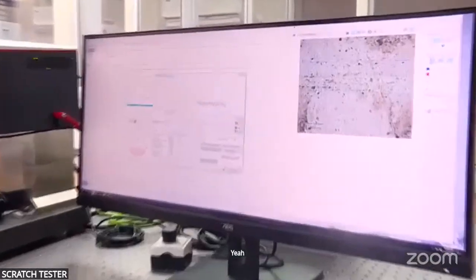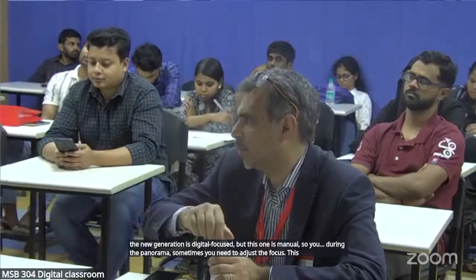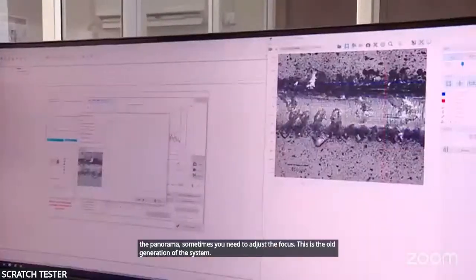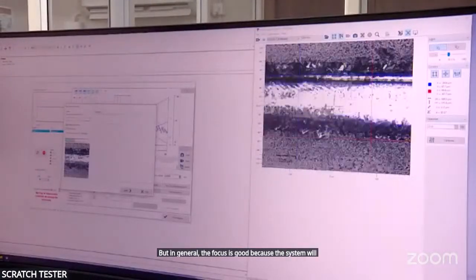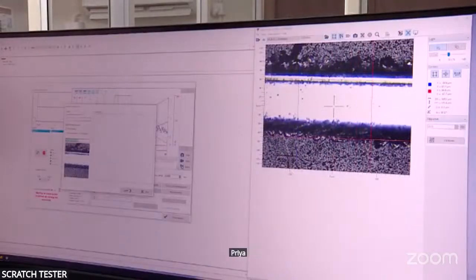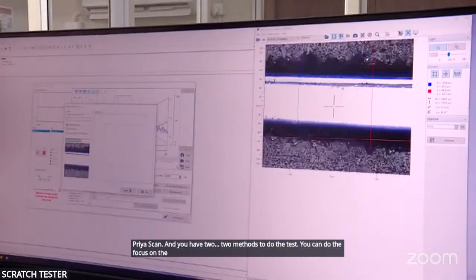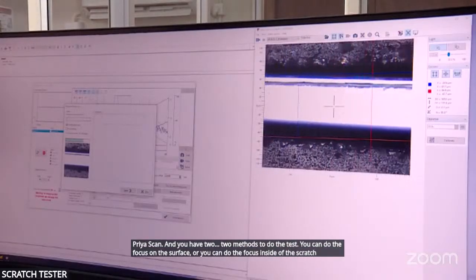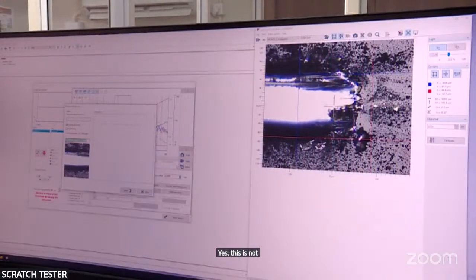This is digital. The new generation is digital focus, but this one is manual. During panorama, sometimes you need to adjust the focus. This is the old generation of the system. But in general the focus is good, because the system keeps the focus in mind when it does the pre-scan. You have two methods to do the test: you can focus on the surface, or you can focus inside the scratch. The depth of focus is shallow, but this is not too important.